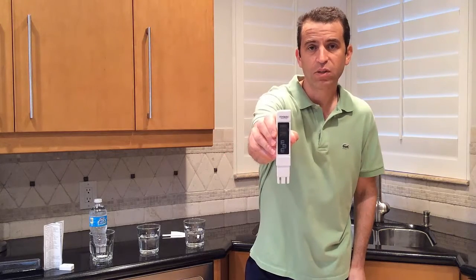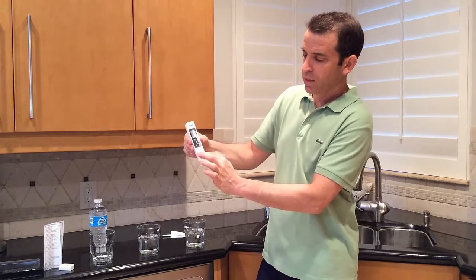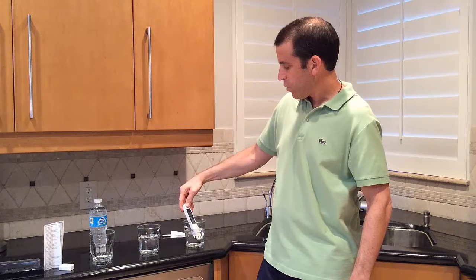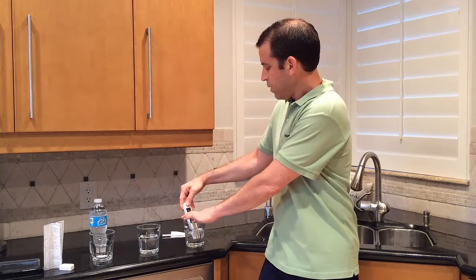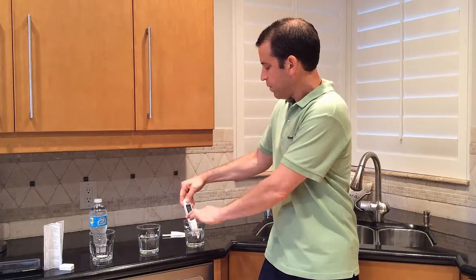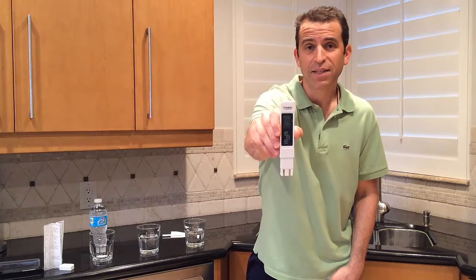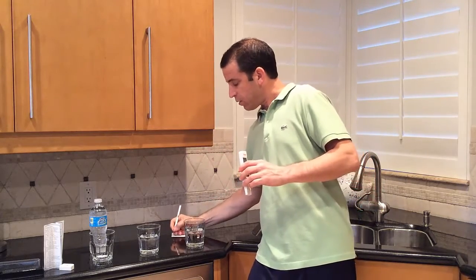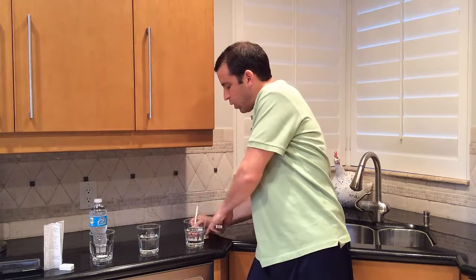Let me go ahead and turn it on. As you can see there are zeros — let's see how quickly the reading comes in. I'll immerse this right up to this point here. I'm getting a reading very quickly. I'll press the hold button — 143. So that is my tap water: 143.